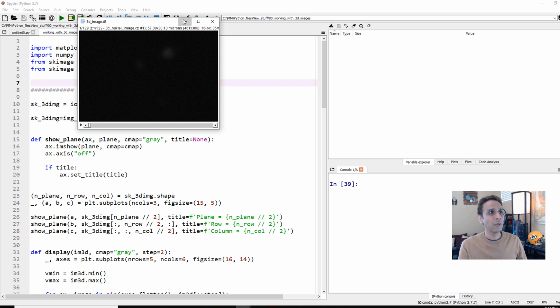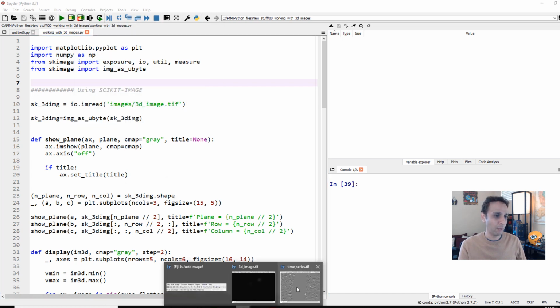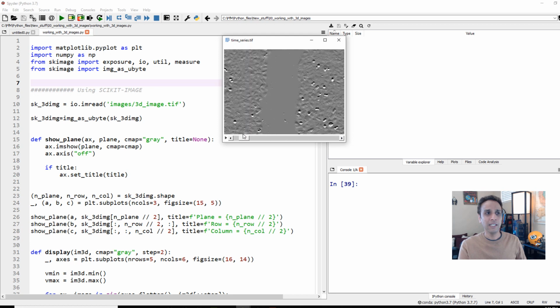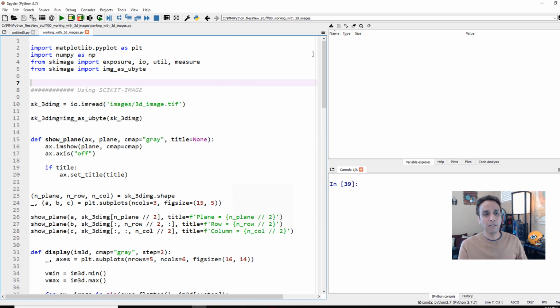And you may also have a time series. It's like a video. I have one of these images right here. You see, this is at time 1, time 2, time 3, time 4, time 5, and so on. Things are changing over time. How do you load this and measure, I don't know, the area here or do some sort of processing to these images? Now, these are simple cases. In real scientific images, it may be even more complicated.